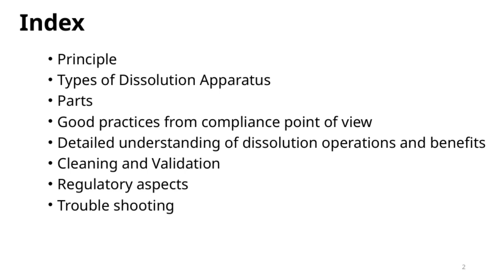We'll start by looking at the different types of dissolution apparatus commonly used in the industry. Understanding these types is crucial because each is suited for specific formulations and testing requirements. Next, we'll examine the parts that make up these apparatuses, emphasizing which components are vital for accurate and reliable results. We'll also discuss good practices from a compliance perspective, ensuring that our methods meet regulatory standards and maintain quality.